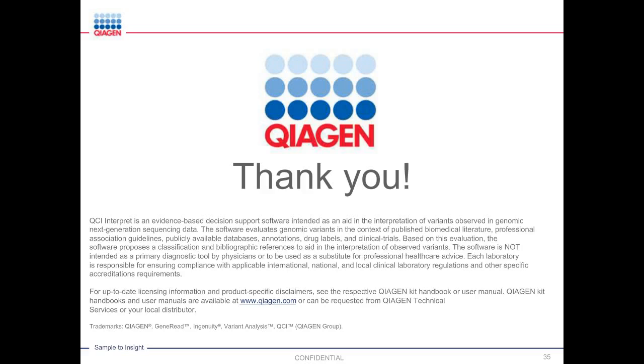If you have a very slow one, then it takes longer. The software can also run on a cluster, so if you have a trio, the variant calling can be parallelized, running mother, father, and child automatically. And then we're talking about a runtime, let's say, between 3 and 5 hours, depending also on the coverage, of course.